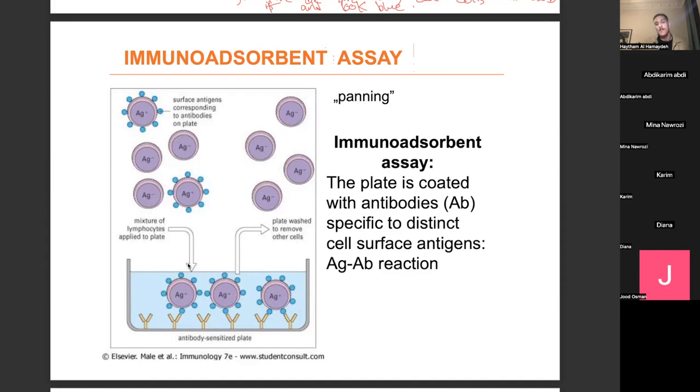What does it do? You have a petri dish, a plate. On the lower surface of the plate, the obvious surface, if you look into the plate, is supplied with standing antibodies. Here, see? Standing antibodies. Fine. What did we say? Antibodies bind to antigens, yes? And so, where are those antigens? They are found on the cells.